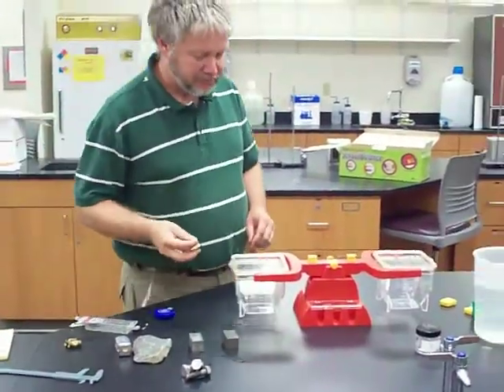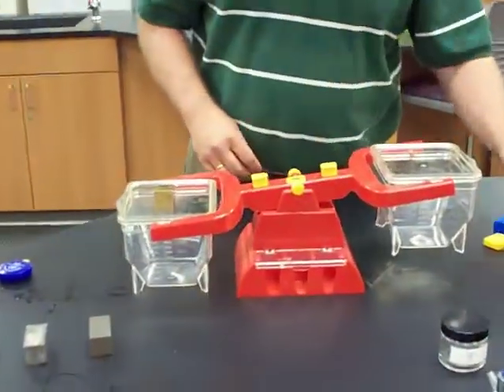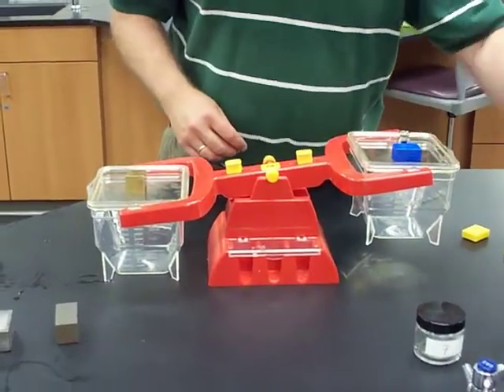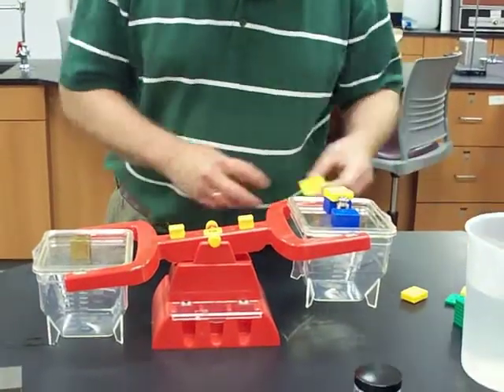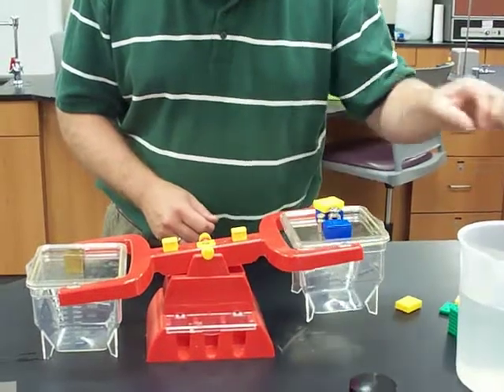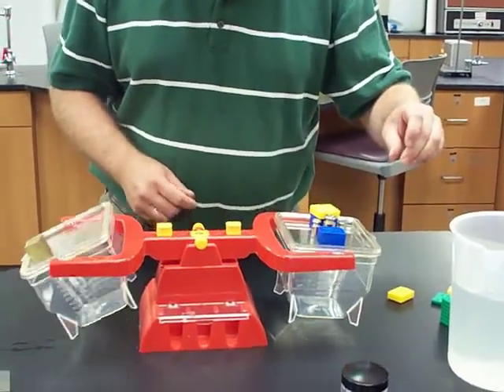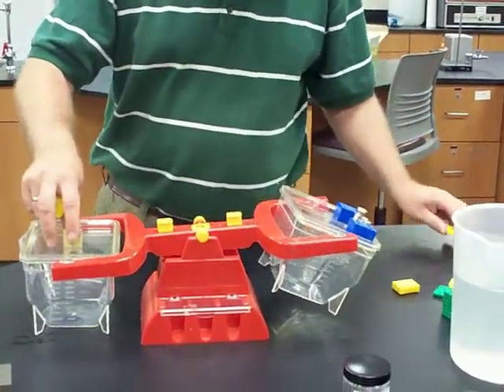Okay, the mass. So I put it on the balance, and then I have these here. Let's see, there's 50 gram, and another 20, and another 20, and another 10, so that's 100. Let's see what I got here. 120, 140, and everything slips.